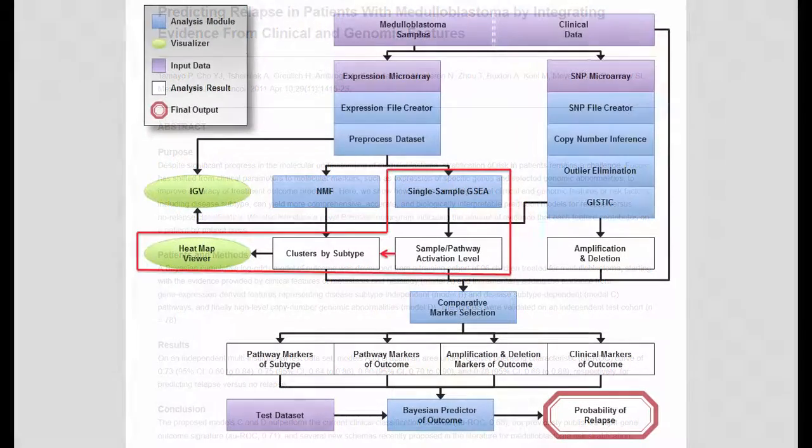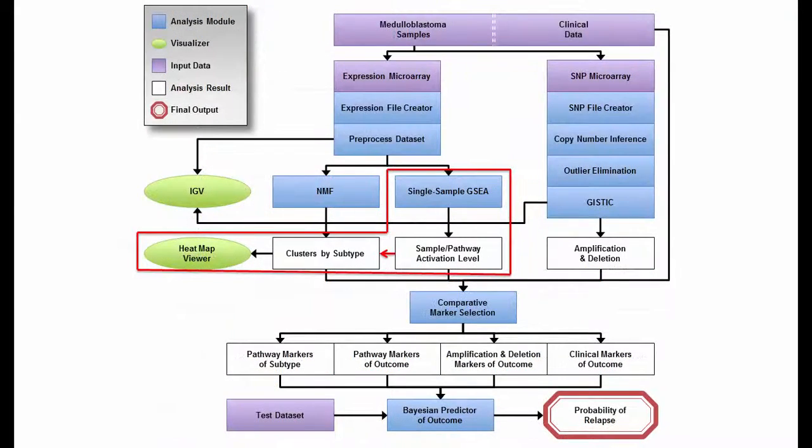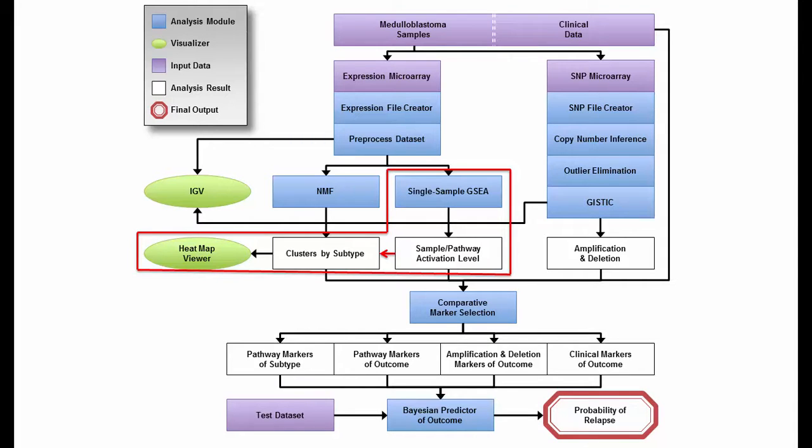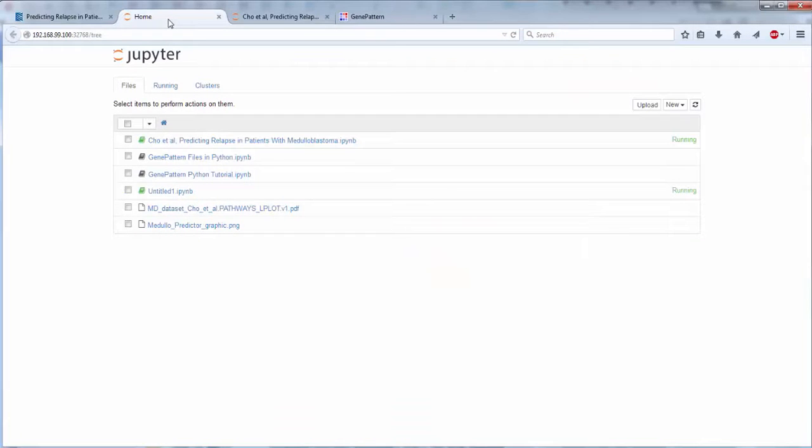We'll illustrate the step in which a gene expression dataset from medulloblastoma samples representing six subtypes is projected from the space of genes to the space of pathways using a GenePattern analysis module.